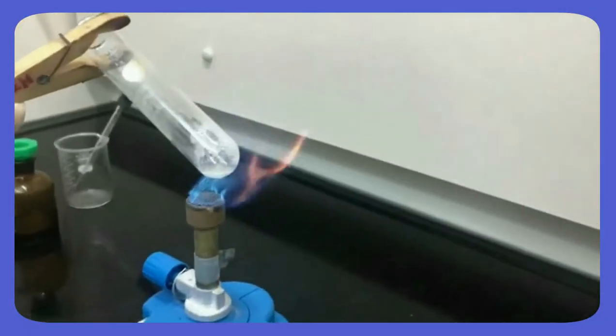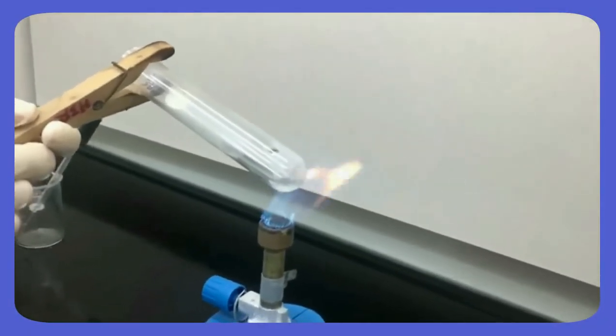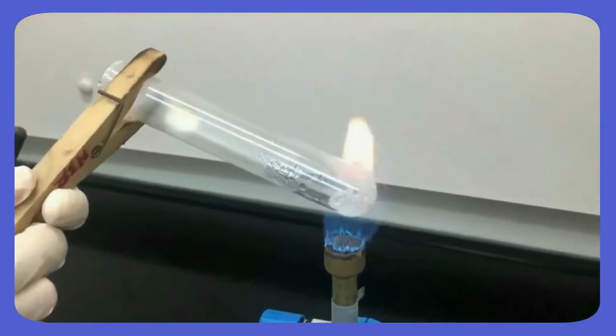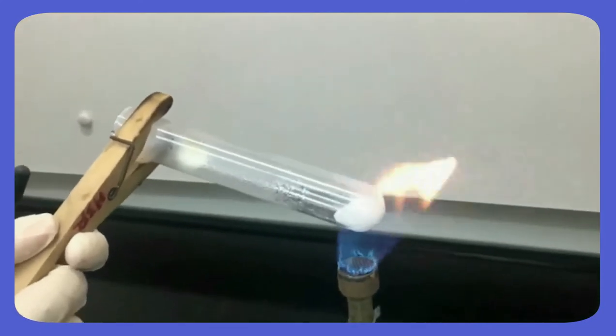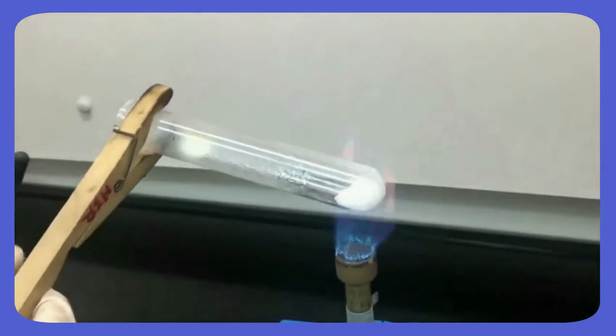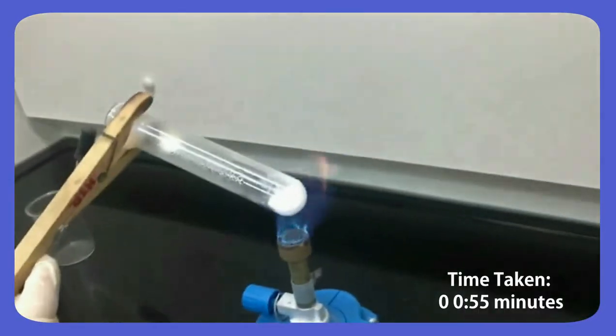Next, we will heat the hydrated calcium nitrate gently with small flame until anhydrous calcium nitrate is formed. After that, we use big flame to heat the anhydrous calcium nitrate. We will observe the color of gas that is formed throughout the heating process.